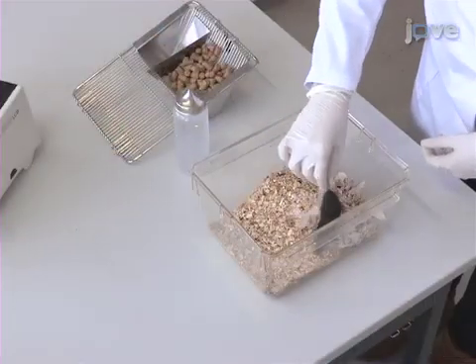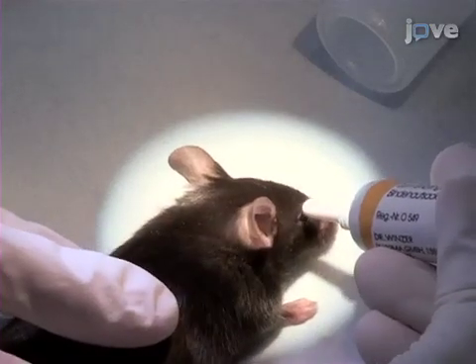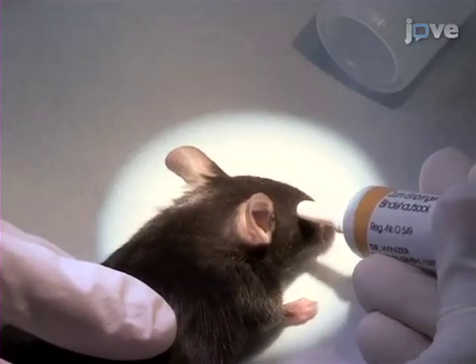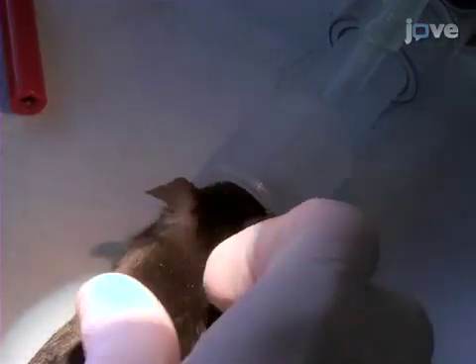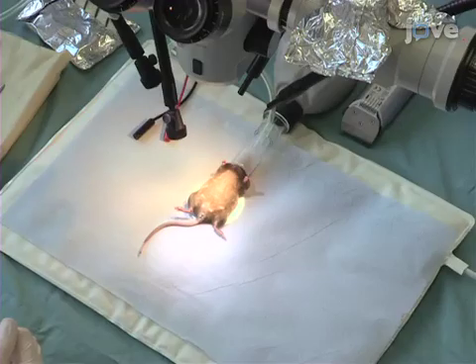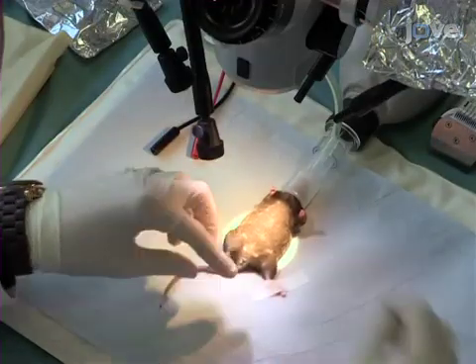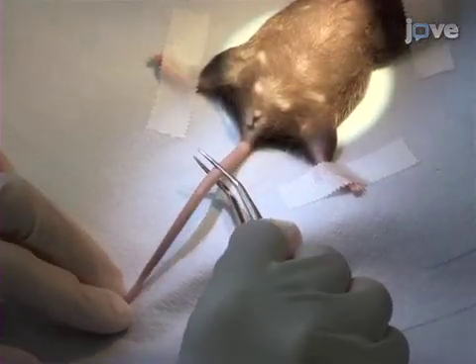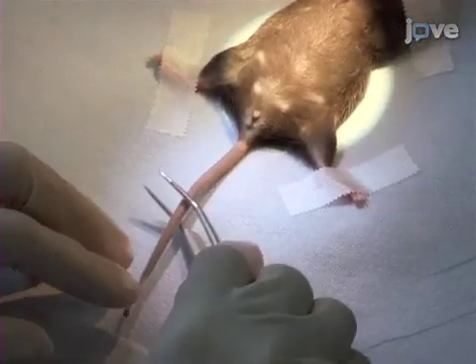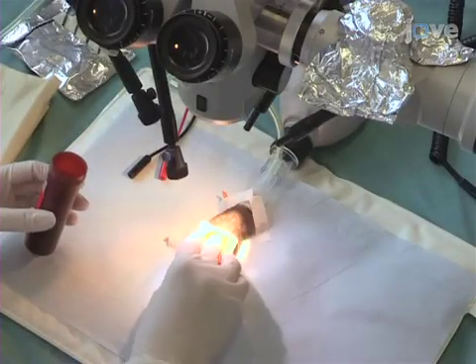Anesthetize a pregnant mouse with isoflurane. After the mouse has been anesthetized, apply ointment to its eyes to prevent drying. Subsequently, fit the mask on its face to maintain anesthesia continuously. Place the mouse on a heating pad with its belly up and secure its body in place by fixing its forelimbs with tape. Make sure that the mouse is completely anesthetized by pinching its tail for reflex. Then shave the abdominal surface and disinfect it with iodine solution.